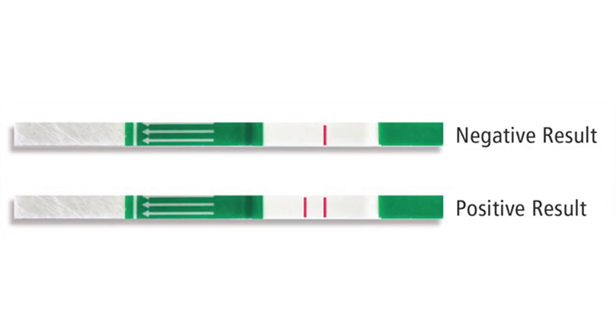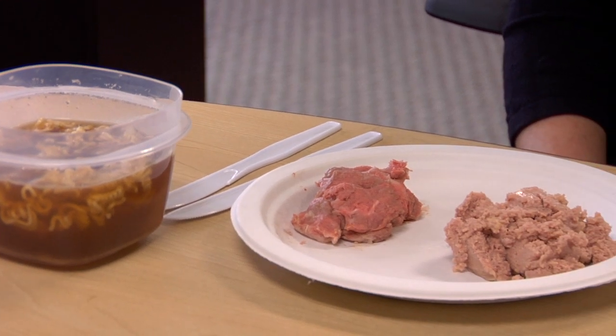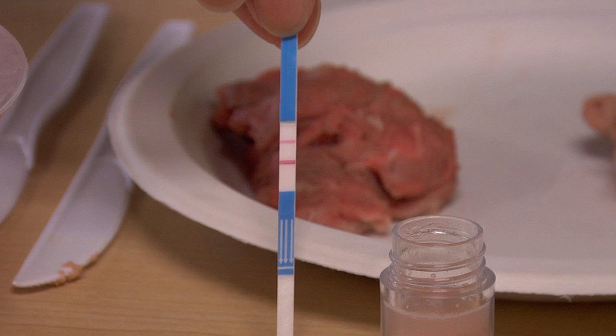If the second line develops, it indicates a positive reading, so the sample contains pork. For the food samples we are analyzing today, you will see that the test strip of the processed meat sample indicates a positive result for the presence of pork. The test strip for the soup sample shows a negative result. The test strip for the raw meat sample shows a positive result, which is correct as this is lamb spiked with pork.